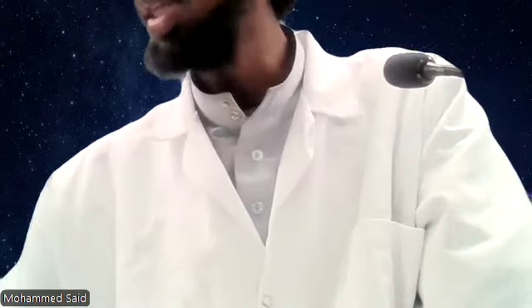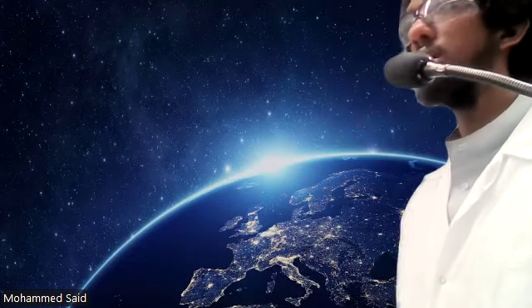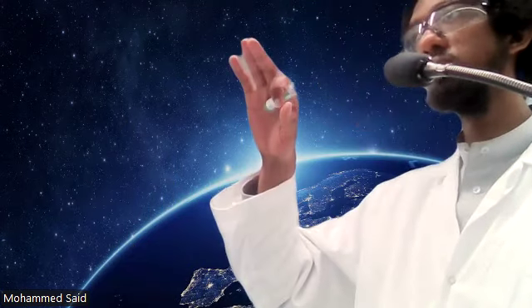One minute. Sorry folks, because I don't want to go behind schedule. Let me briefly go through exercise 2. So pretty much, you're gonna make plates that are labeled. Folks, by the way, is your question exercise 2 related? Okay. You want to show me your pellets?